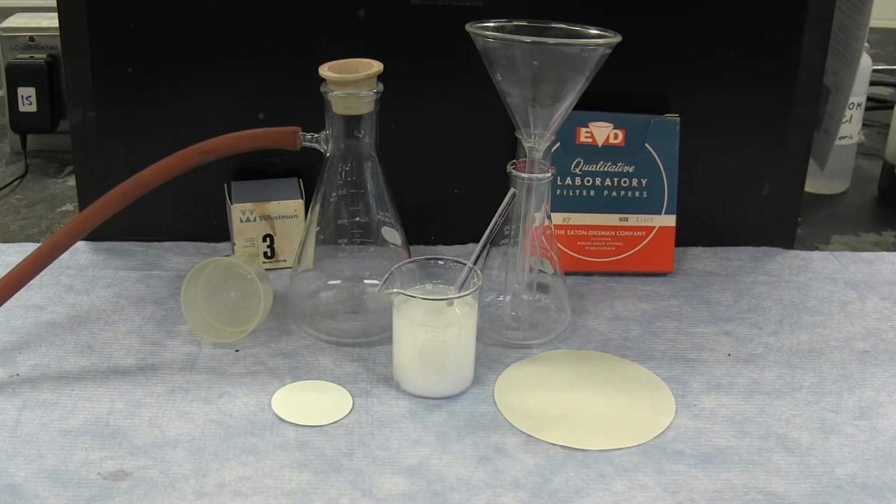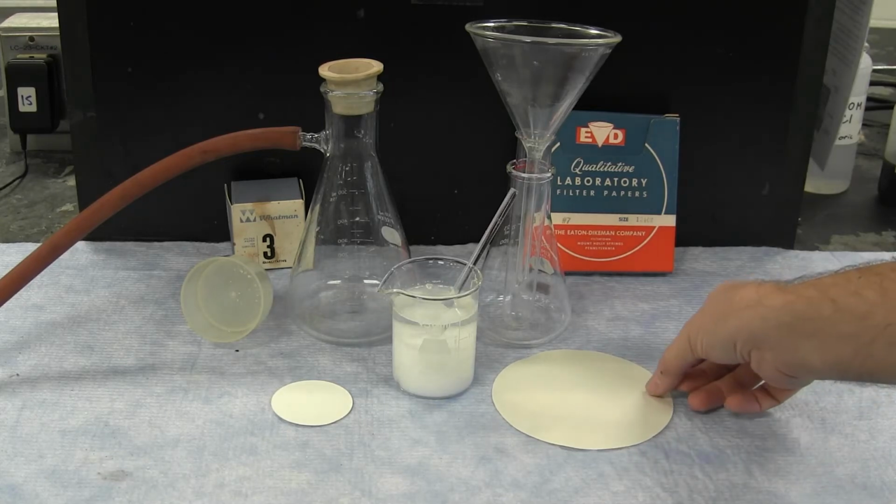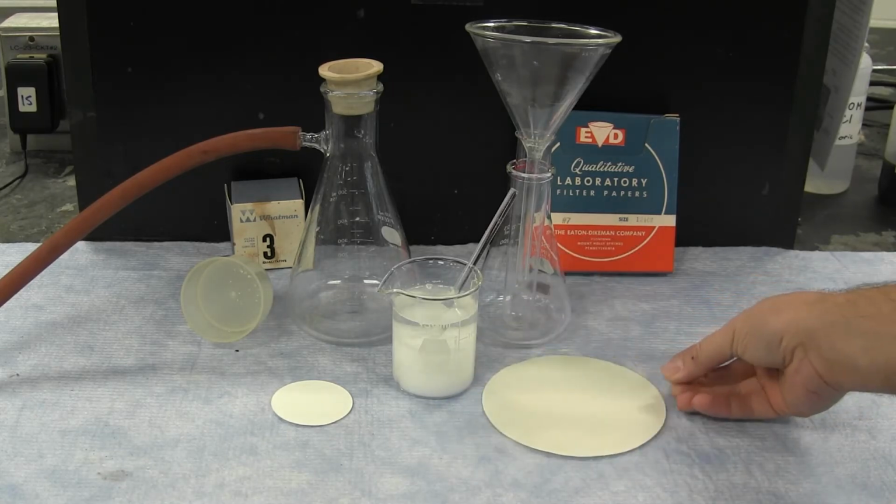In a lab setting, one of the very important techniques when dealing with precipitation or recrystallization reactions is how to filter off the solid and the liquid. And many times this is done through the use of filter paper, very similar to coffee filters at home. There are two basic types of filtration using filter paper: gravity filtration and vacuum filtration. In both instances, the filter paper is provided in circular sheets.